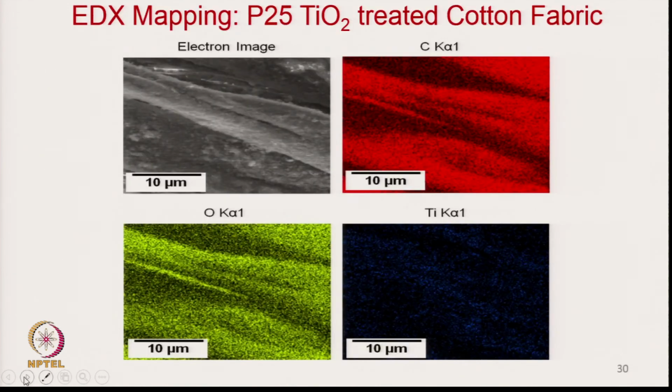Then EDS, also called EDX, can do mapping. You have a surface of your sample and you have amplified it in SEM. EDX actually works in combination with SEM.